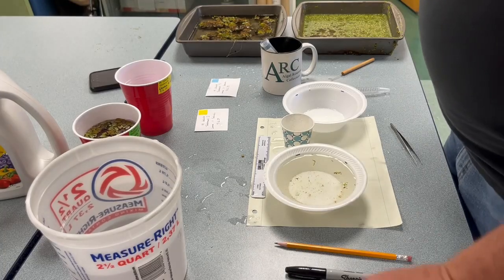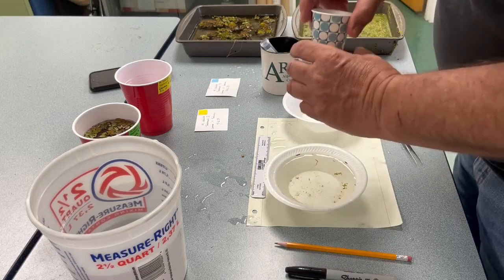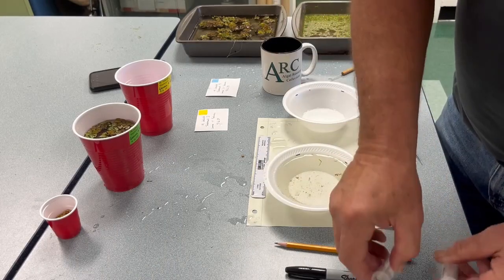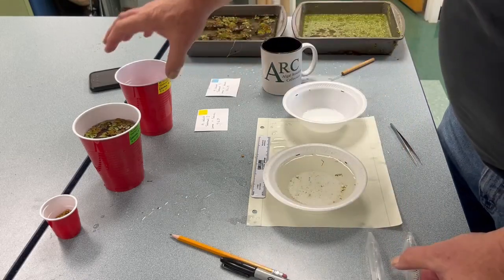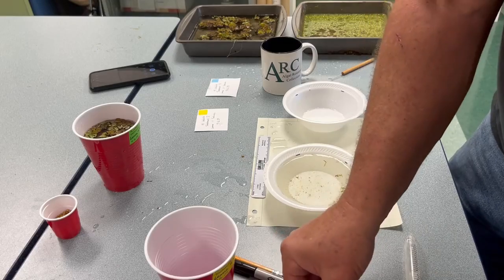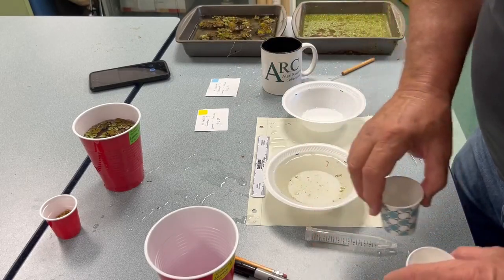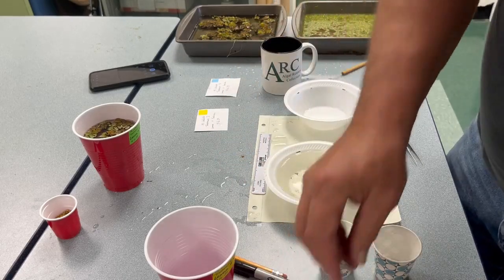We do the other ones kind of the same way, except that instead of 2 cups of the big and 2 little of these, the way we did it with the first one, for the second one we want a 50-50 mix, and so we get 1 of each type for both. And for the third one, we do the reverse, the Lemna in the big containers and 2 small containers.